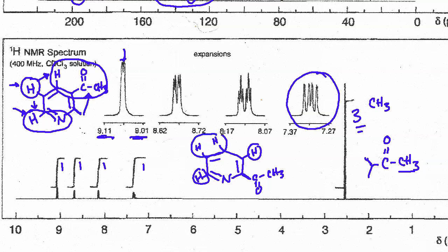But then these are both away from the electron withdrawing groups. And so what would happen is these would each try to give their own signal, but they're so far away and it's difficult for them to be differentiated that you're going to probably end up seeing some sort of clustering. So you won't get this nice clean separation. You'd probably, right around this region right here, end up getting just a giant multiplet of that group. All right, so that's not what we see here, and because of that, it's going to be proposed that the structure would be the original one we went with, which would be the position 3, or you can call it the meta position.